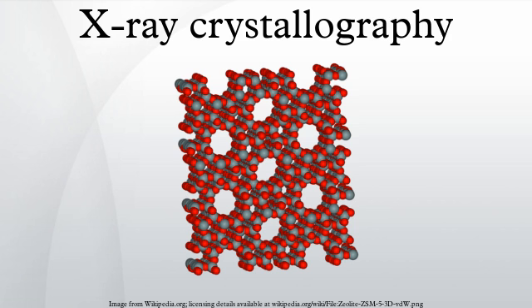Data analysis: crystal symmetry, unit cell, and image scaling. The recorded series of 2-dimensional diffraction patterns, each corresponding to a different crystal orientation, is converted into a 3-dimensional model of the electron density. The conversion uses the mathematical technique of Fourier transforms, which is explained below. Each spot corresponds to a different type of variation in the electron density. The crystallographer must determine which variation corresponds to which spot, the relative strengths of the spots in different images and how the variations should be combined to yield the total electron density.